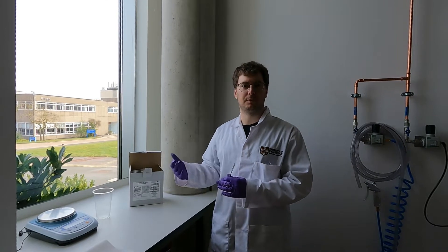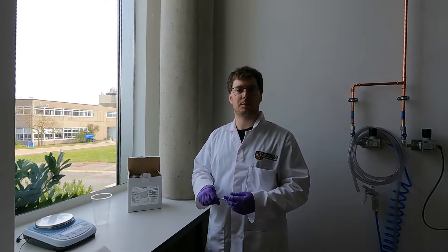We finished hard-baking the sample, so the next step will be to put the sample in a container. In our case we're going to use a Petri dish and we're going to pour over the sample with the SU8 pattern on top of it. We're going to pour over the PDMS mixture.